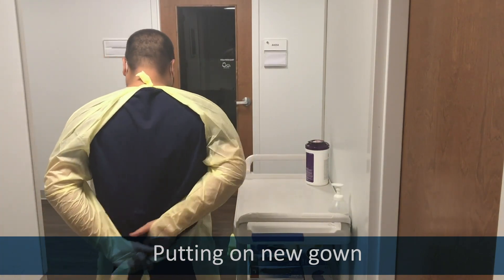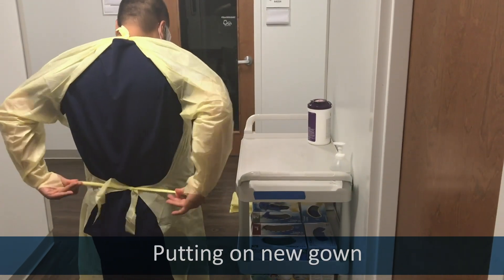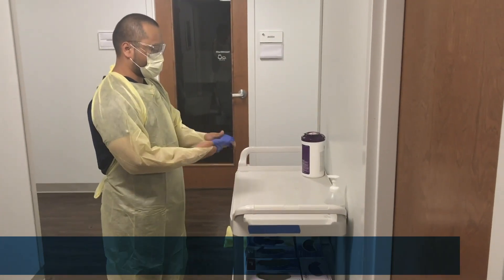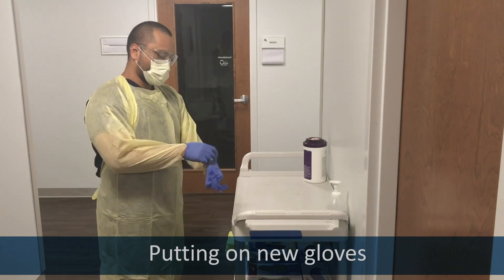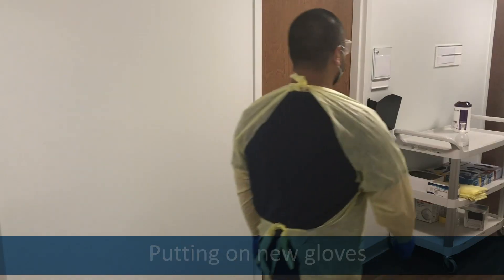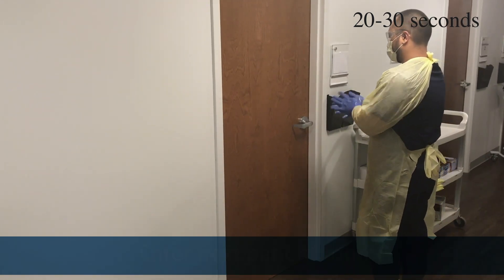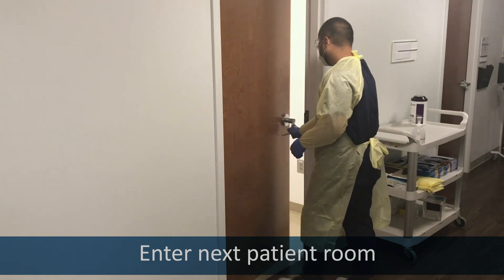Then tie the waist behind you as you normally would. Put on fresh gloves. Sanitize your hands very well. Enter the next patient room with a suspected or confirmed COVID-19 patient.